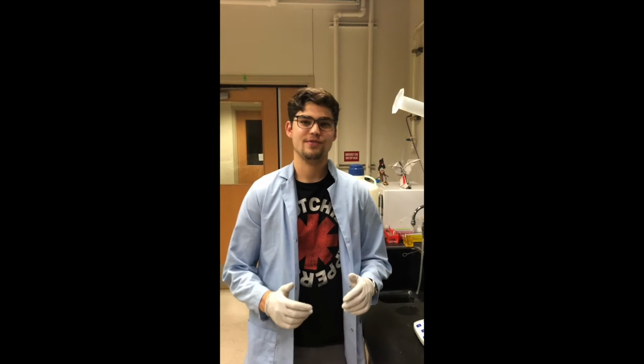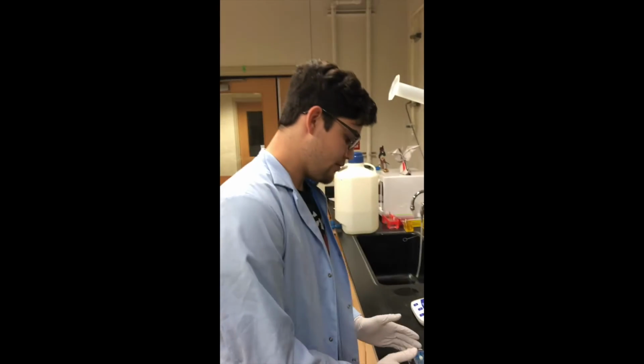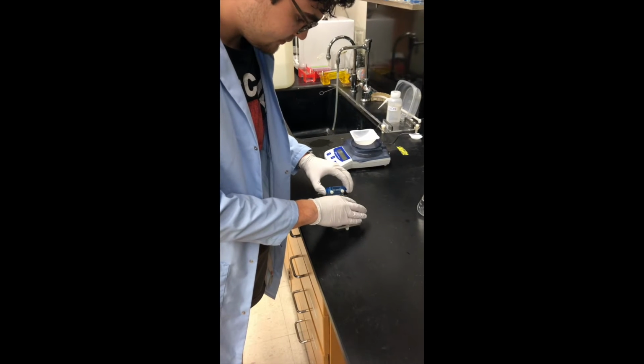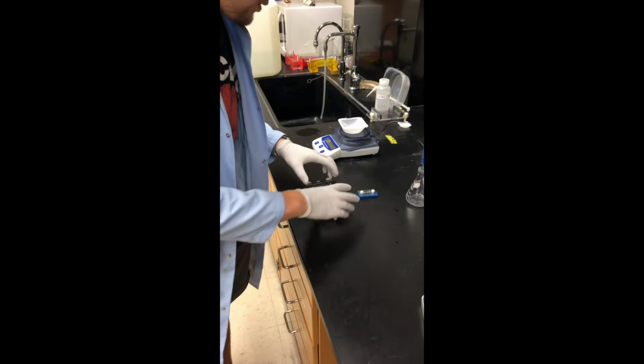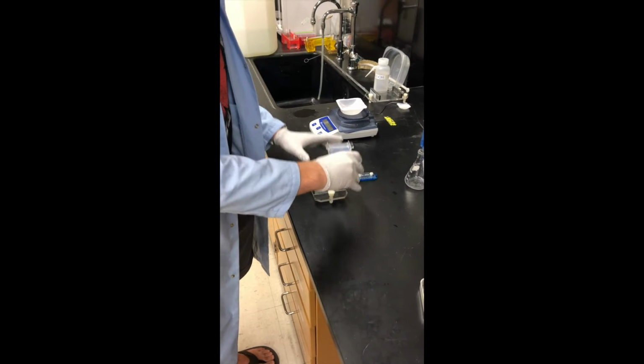20 minutes later. Alright, so we've waited our 15 minutes and our gel is dry. So our first step here is to remove it from the tray. So we're going to remove the comb carefully. Alright, then you're going to remove it from the tray. And we will keep it in this tray and then place it in the tank.